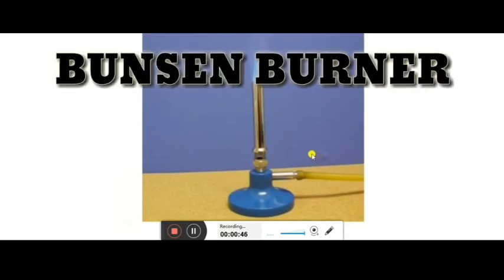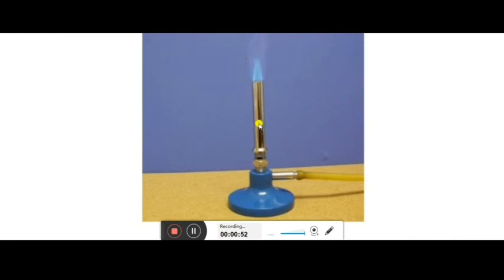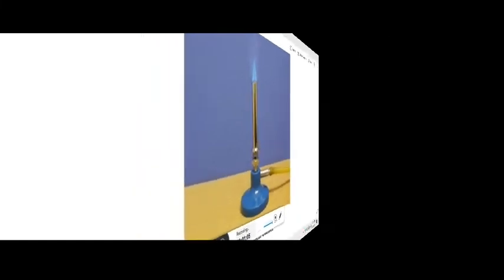This one is the Bunsen burner, and this is also used for the heating purpose. The only difference between the spirit lamp and the Bunsen burner is that this one uses gas as a fuel, and the spirit lamp uses spirit as a fuel for heating.